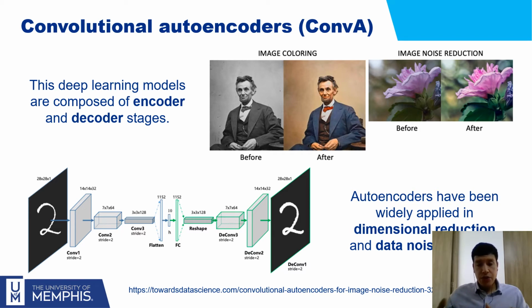While using CNNs to classify some sort of information within an image, it is also important to see how we can map information from a raw DHM hologram to its corresponding phase reconstruction. To do this, we need a more elaborate algorithm or model. In this case, we're going to introduce the concept of convolutional autoencoders. So what's the main idea behind these algorithms?